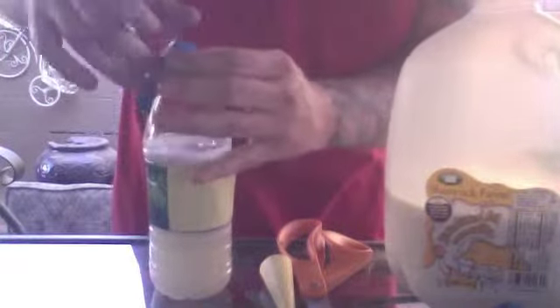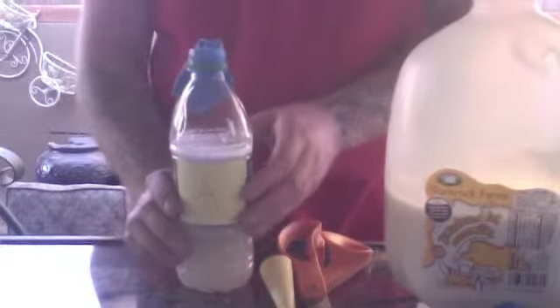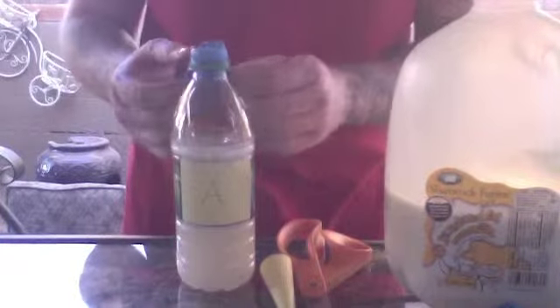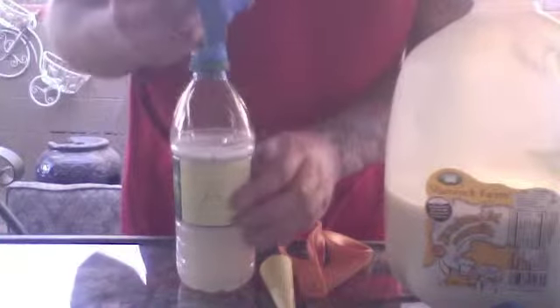I'm going to put the balloon on it. We made sure that the balloons do not have any holes or rips and that they can hold air. So I'm going to make sure all the air is out of the balloon and put it over the opening. Okay, and it's all set. Now if the yeast metabolizes the sugar, then the carbon dioxide byproduct should fill the balloon.